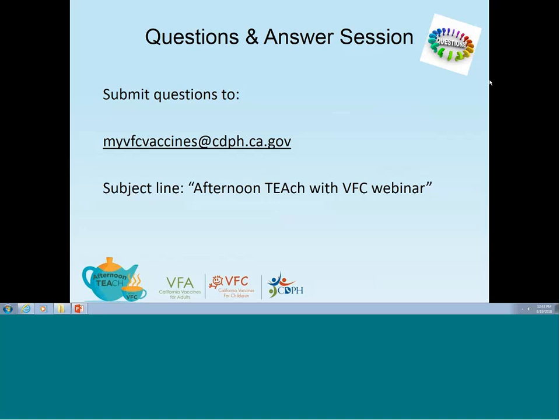And nowadays, we have more and more data loggers that are moving to web cloud downloading of the data and text alerts.